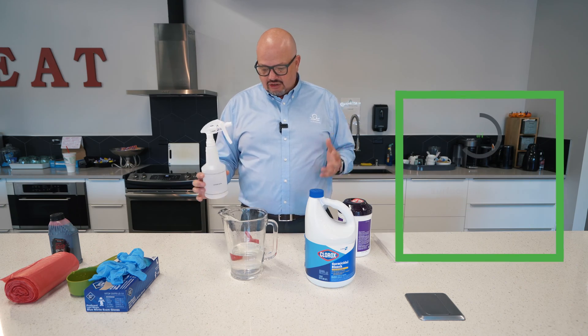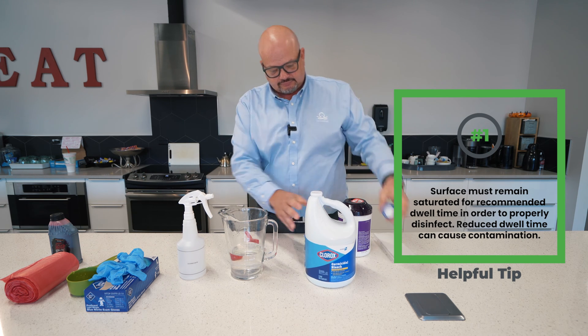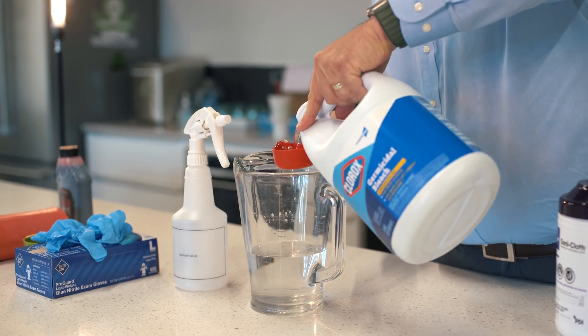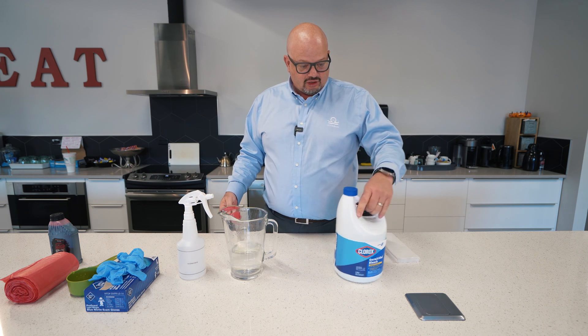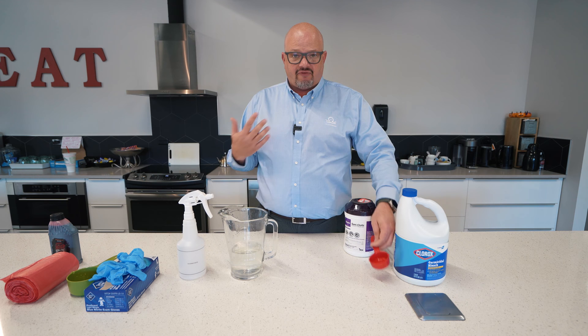We want to make a 1-to-10 dilution with a three-minute dwell time — meaning it stays wet for three minutes, which is very important for it to work properly. So I'm going to put one-fourth cup of regular household bleach into this water. Now I have my properly diluted tuberculocidal disinfectant for blood-borne pathogen spills, which could be blood, vomit, or any bodily fluid.